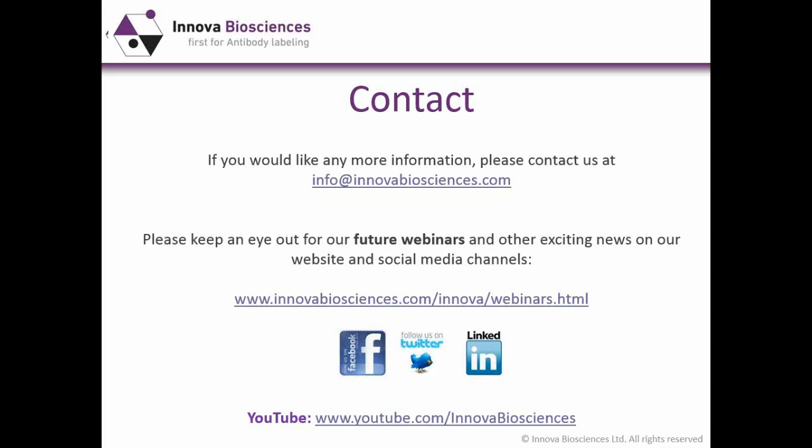Okay, and our next question is, what about hydrophobic interaction chromatography? Right, that's certainly one of the techniques that I haven't included in the main webinar. In effect, it's a technique that you can use to polish antibodies that have been purified by other methods. It relies on the interaction of antibodies with a hydrophobic ligand on a column matrix.